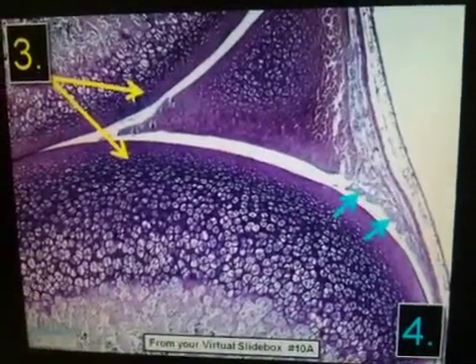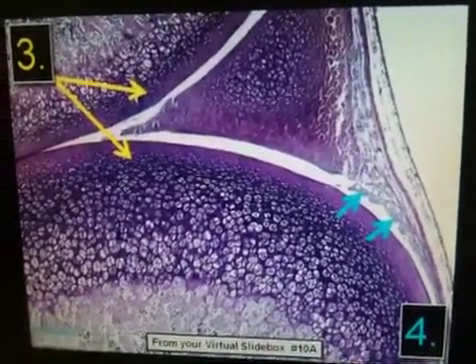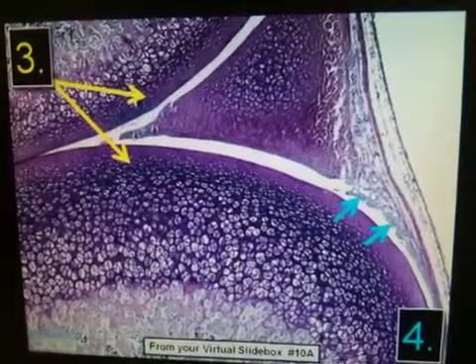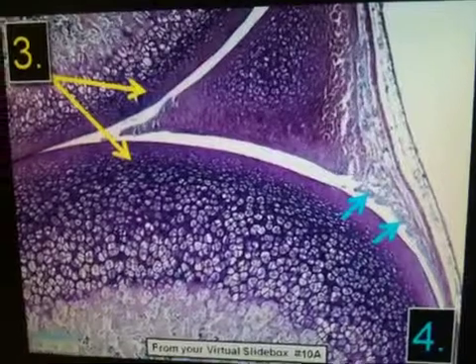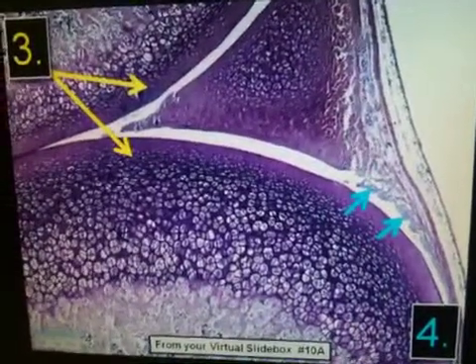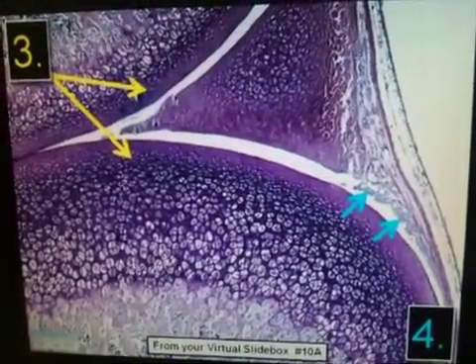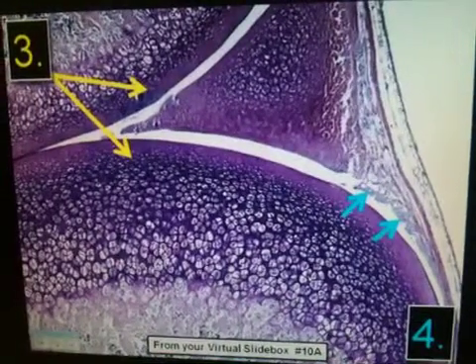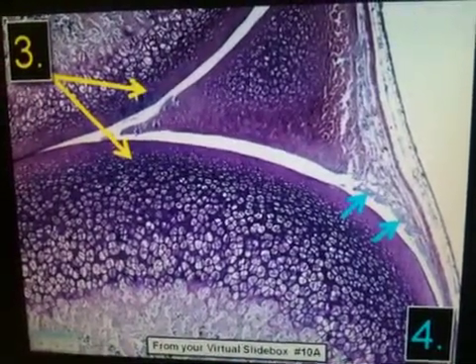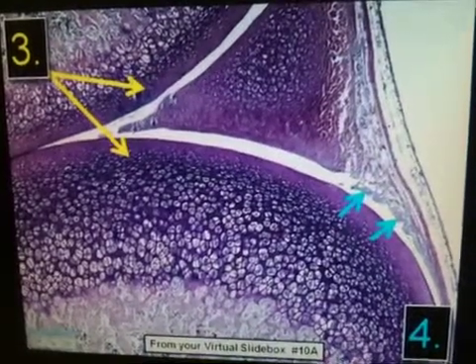What is indicated at the tips of the blue arrows? What main role is associated with it? I think I know. What function is associated with it? Oh, I know what it is. Is it the fibrous?